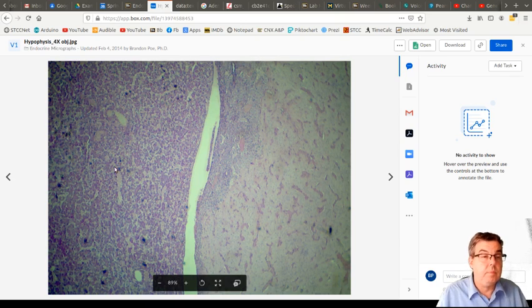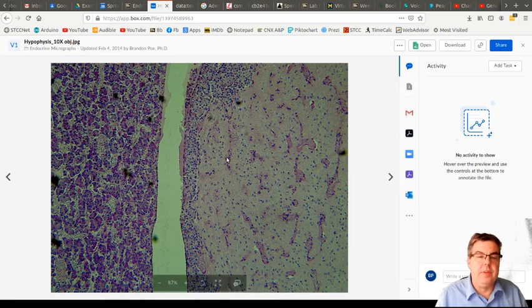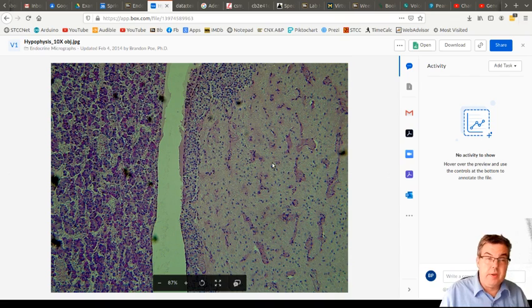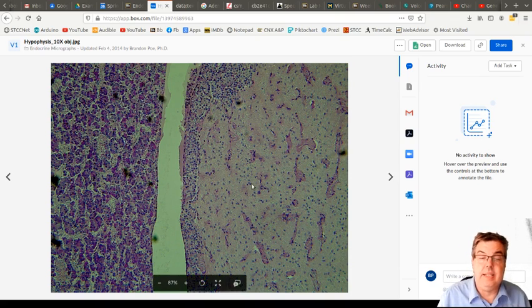The glandular tissue of the adenohypophysis is what we want to concentrate on a little bit more. I think if I go this way, yeah, so this is the same slide. There's a crack between the tissue, and we just see a little bit more detail. We've moved to a higher power magnification, and now we can actually see nuclei. So before we were using the 4x objective, now we're using the 10x objective, so that's the difference between 40x magnification and 100x magnification. And now we can see the detail and make out nuclei.